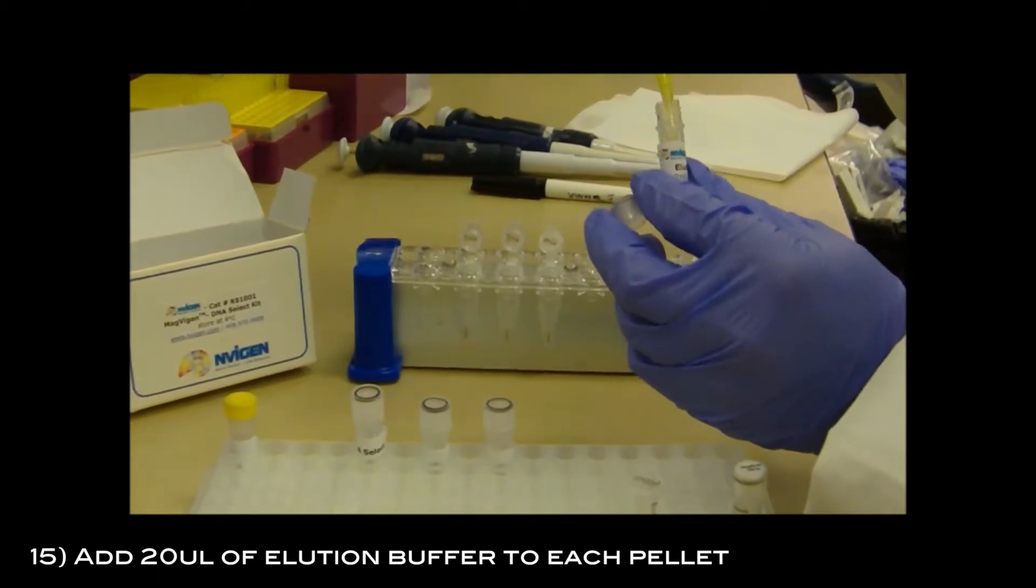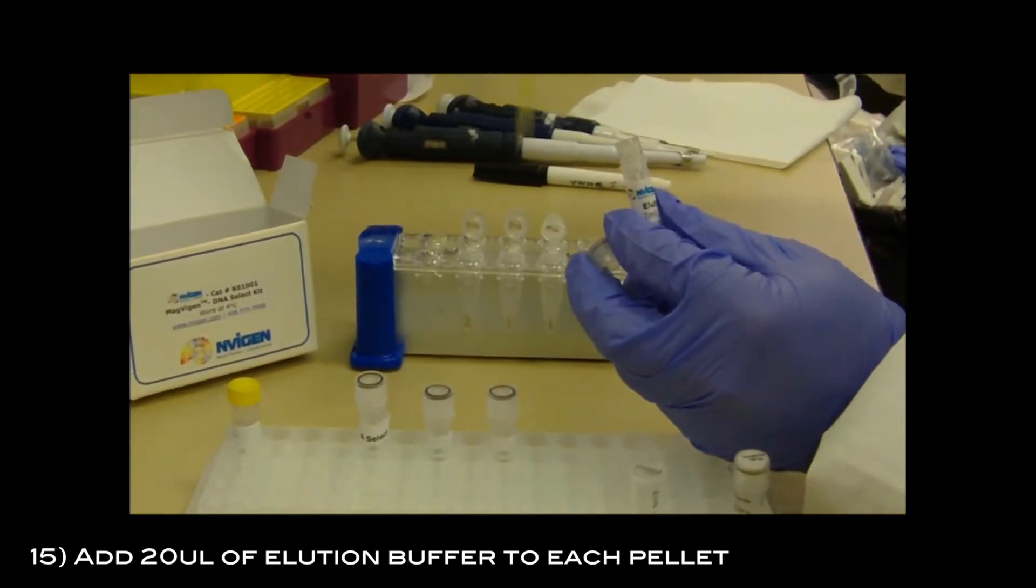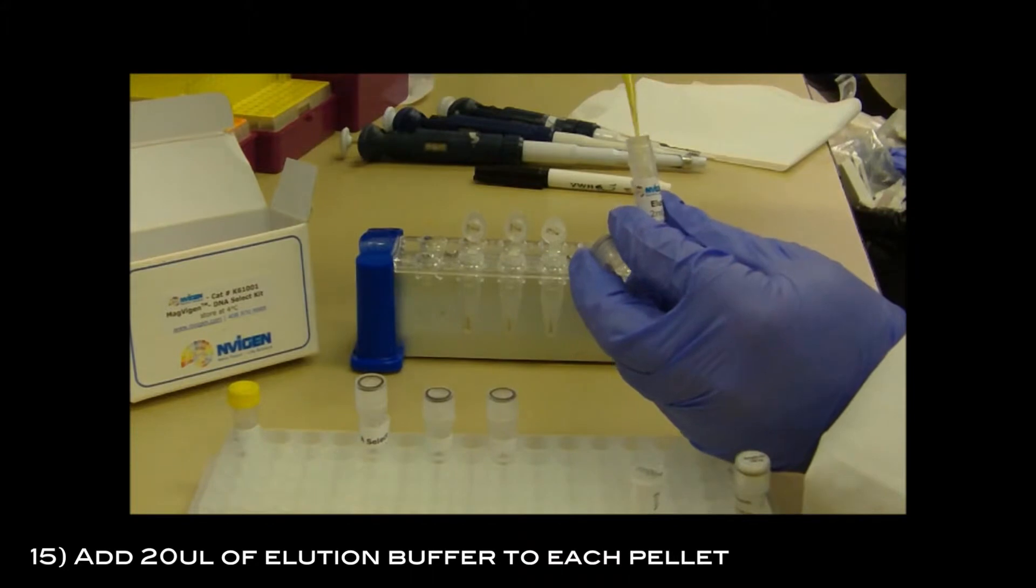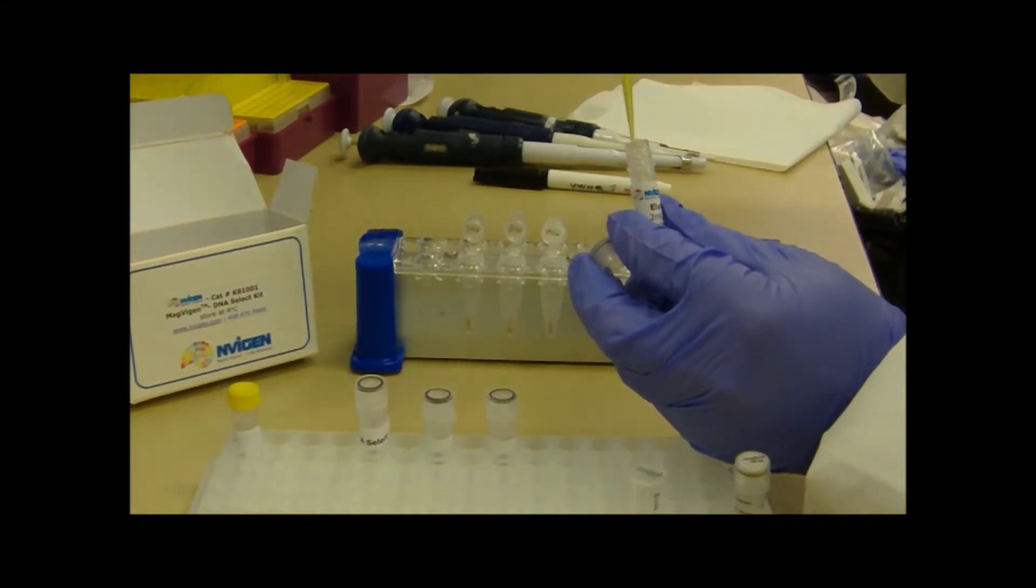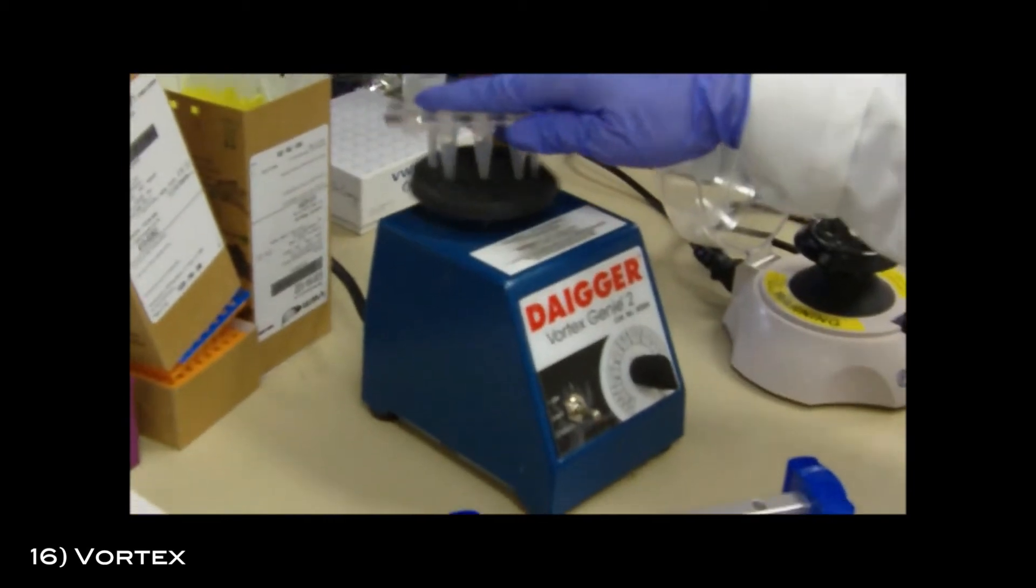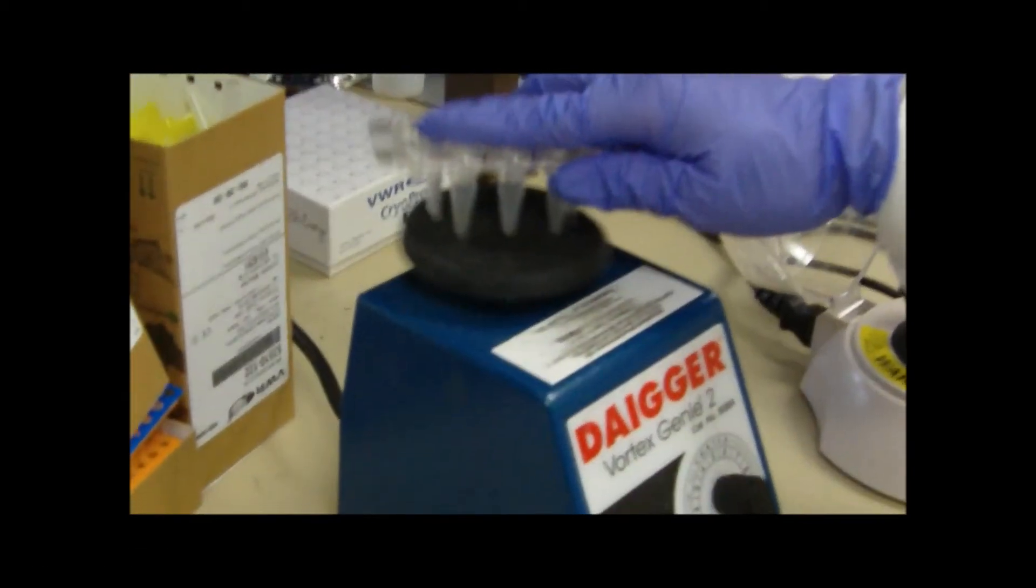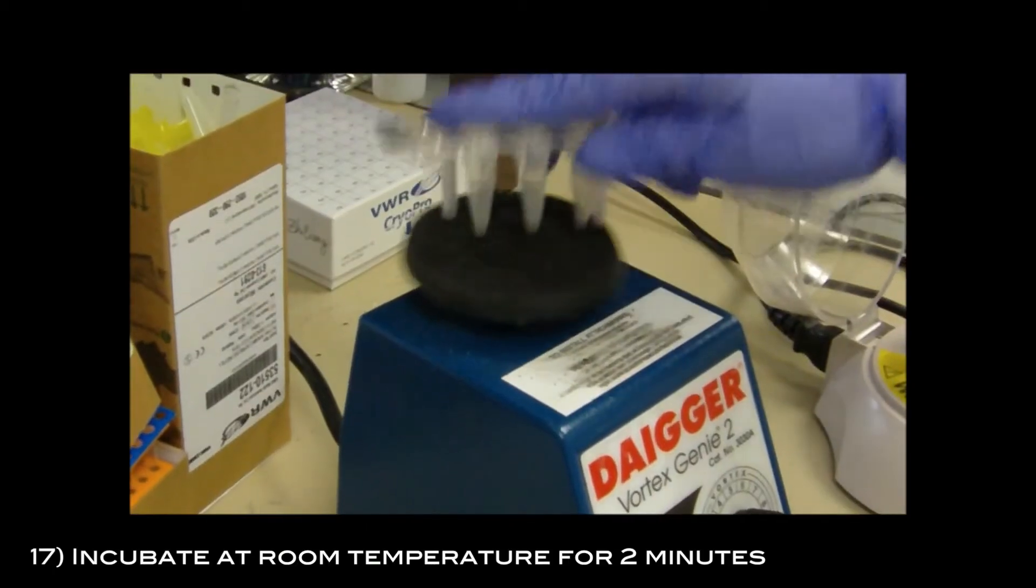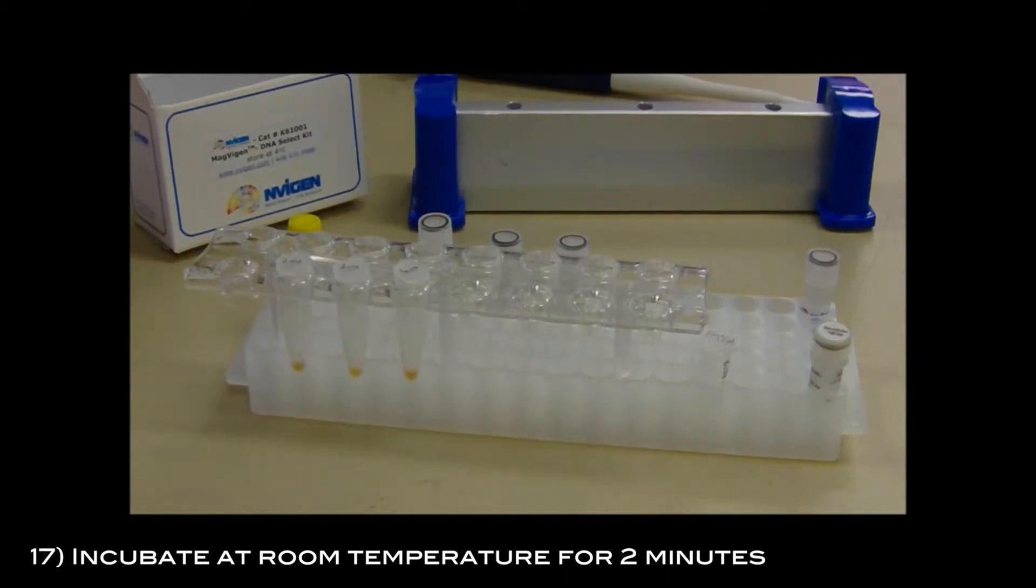Add 20 microliters of elution buffer to each pellet and vortex to mix well. Incubate at room temperature for 2 minutes.